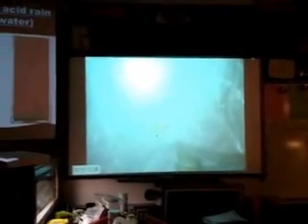Then you can observe what's going to happen. Observe the color. And observe, there's going to be a brown smog that's going to be produced. And I'm going to zip this up because we don't want to breathe this up close. Not a lot. And then I'm just going to go like this. Do you notice right away? Look what happens to that penny.